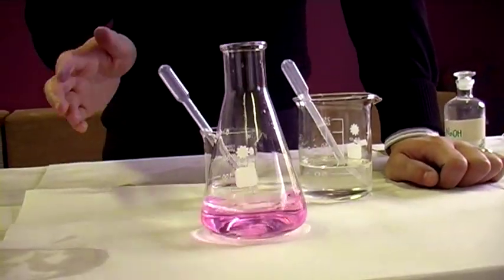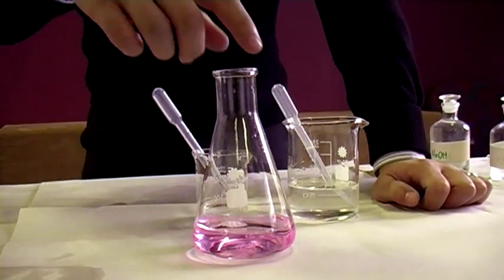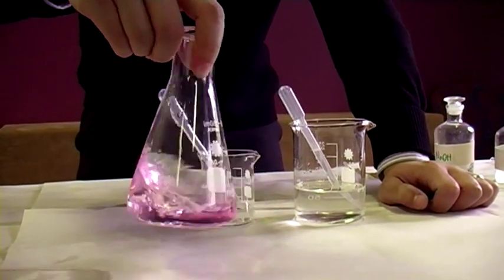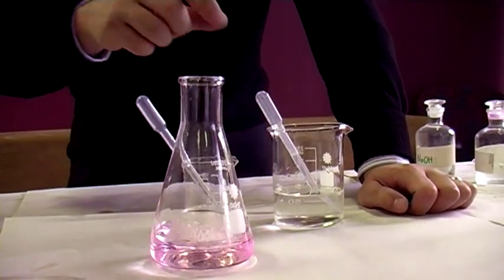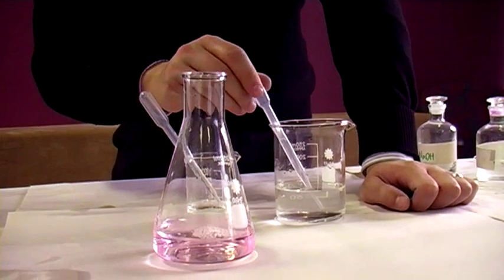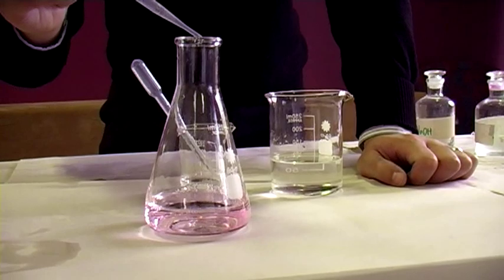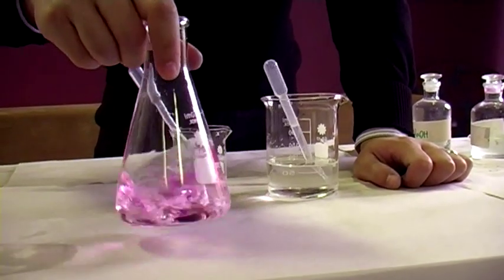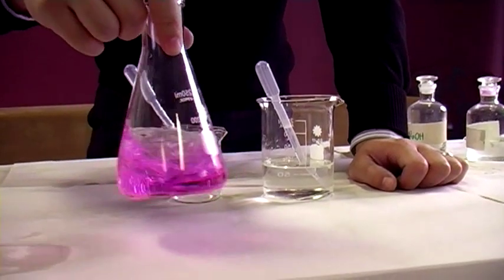Also, if I was doing this titration properly, I would also get the distilled water bottle and give it just a rinse along the sides, just to ensure that I'm not missing any moles of the acid or the base. One more drop, and that should lead to a permanent colour change. I'm pretty sure this will be permanent.